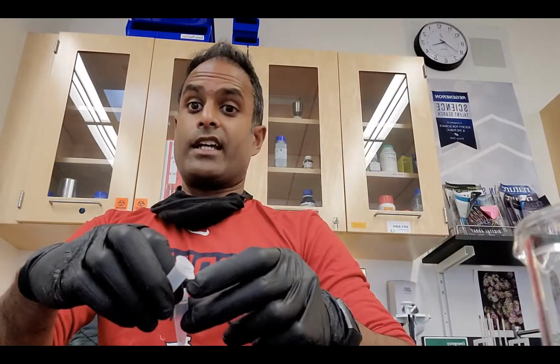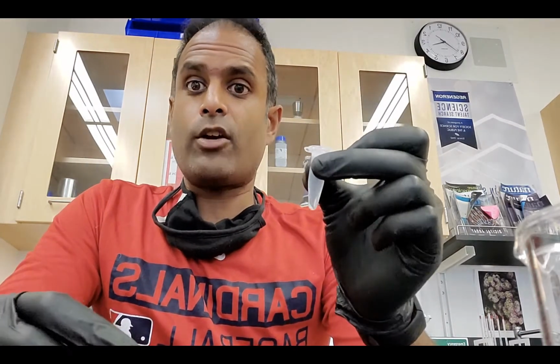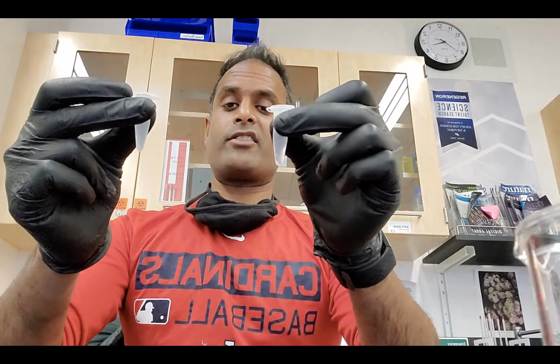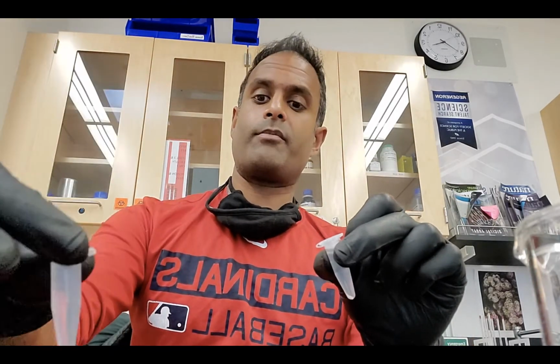Okay, great. I just got done centrifuging, and now I'm going to show you what I did. When I centrifuge, if I take one tube, I almost always take another tube with me to counterbalance. When things are in the centrifuge, they're spinning really fast, so if there's something on one side, I've got to make sure there's something on the other side. So I just took a tube of water with me.